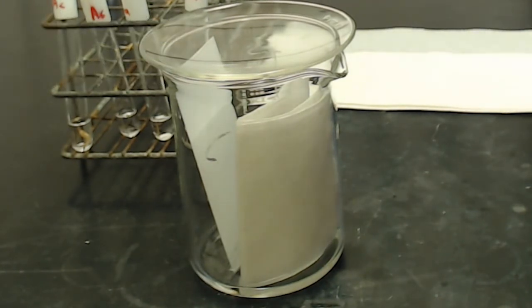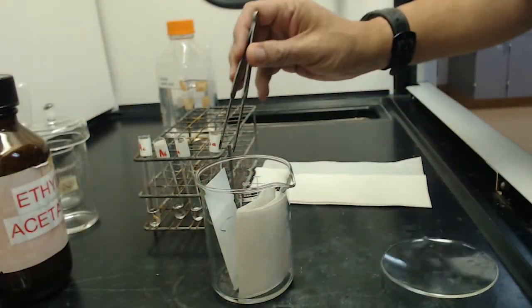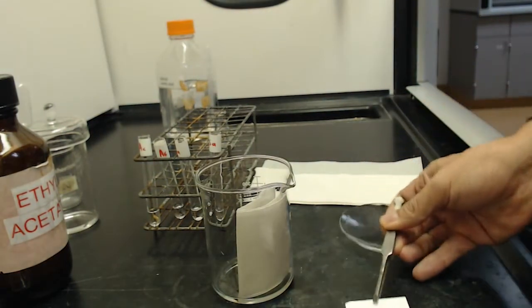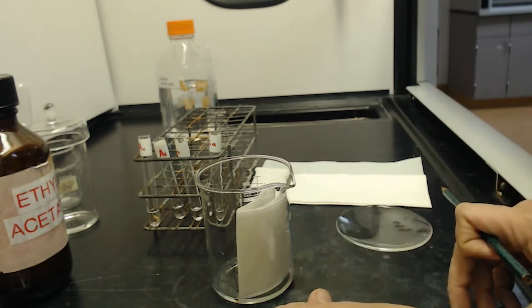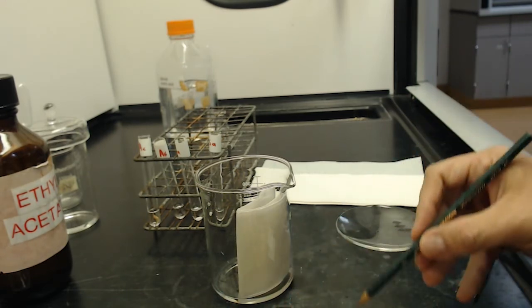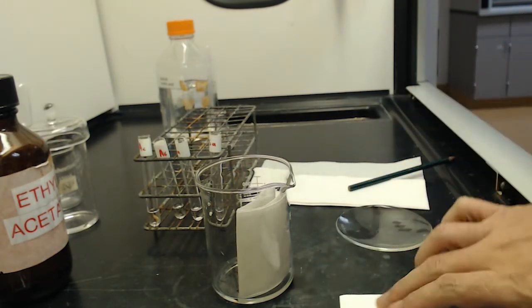All right, we're going to call this one good enough too. Just like before, make sure that when you take them out that you mark them right away. Do not wait. I've seen so many students do that and they have to do it over because they don't know how far it went. Okay, I'm going to go ahead and give that a few minutes to dry and then we'll take it over and develop the plates.